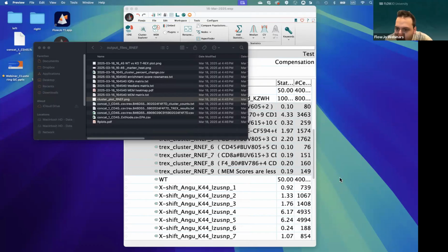Questions, what is the process for taking clusters and then performing differential analysis? Differential analysis, you mean, Lucas, between the conditions to check which clusters are more frequent in which condition, or something else?